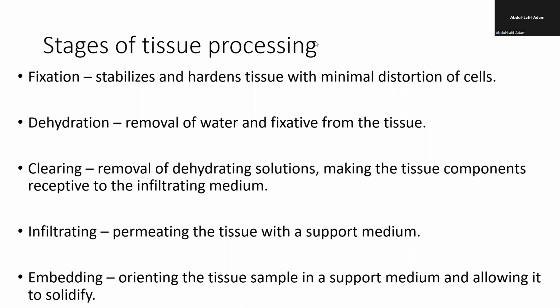Ideally, when you talk about tissue processing, it starts from dehydration, not from fixation, because it is assumed that fixation will start from the theater where the sample is taken. So by the time the sample gets to us in the pathology lab, it is fully fixed.